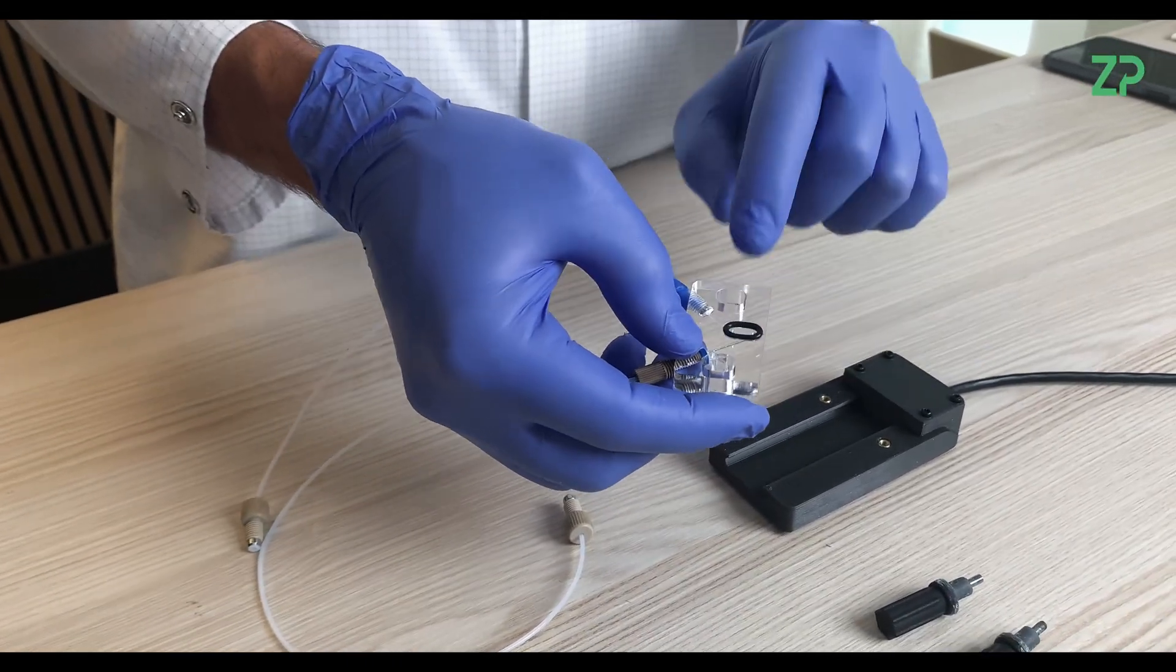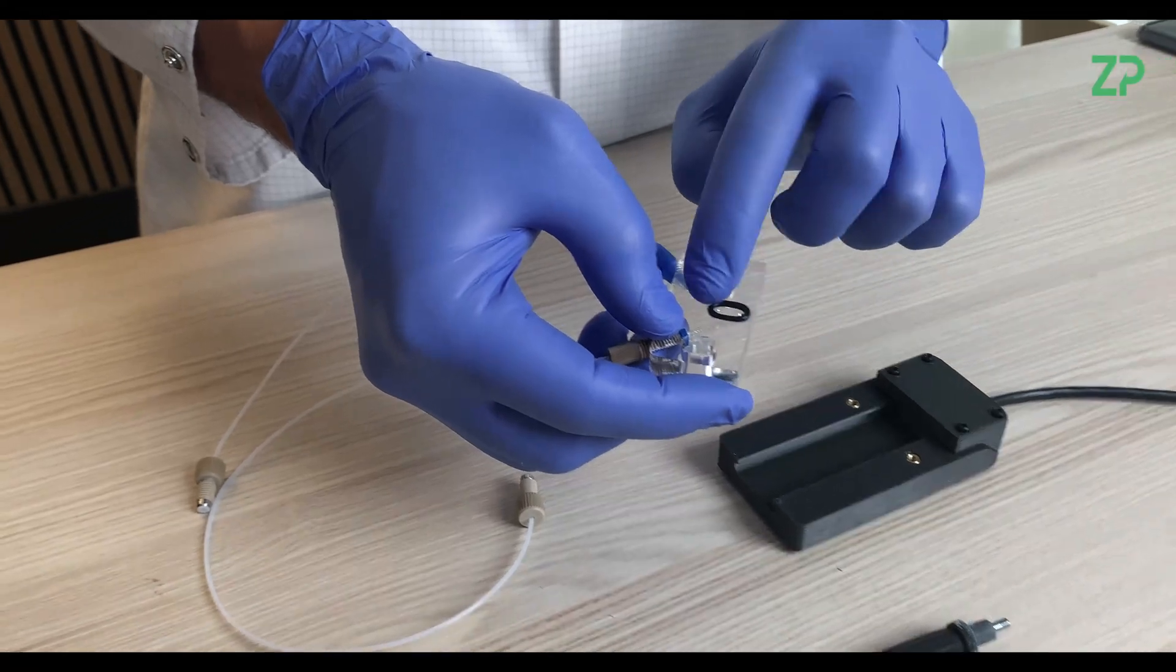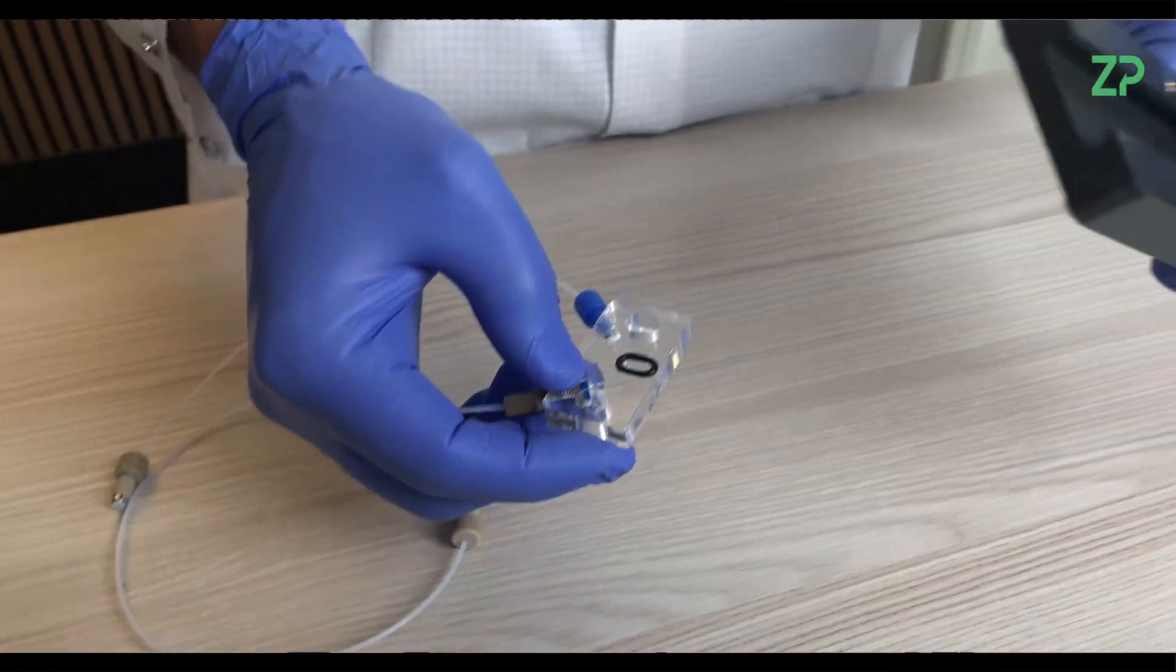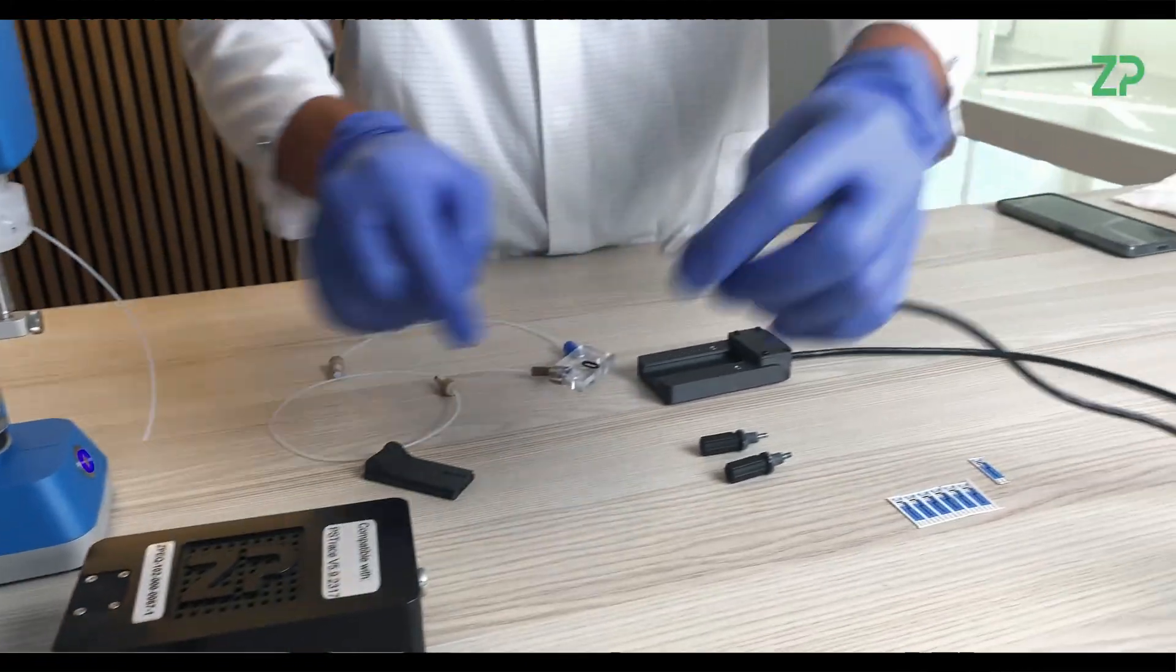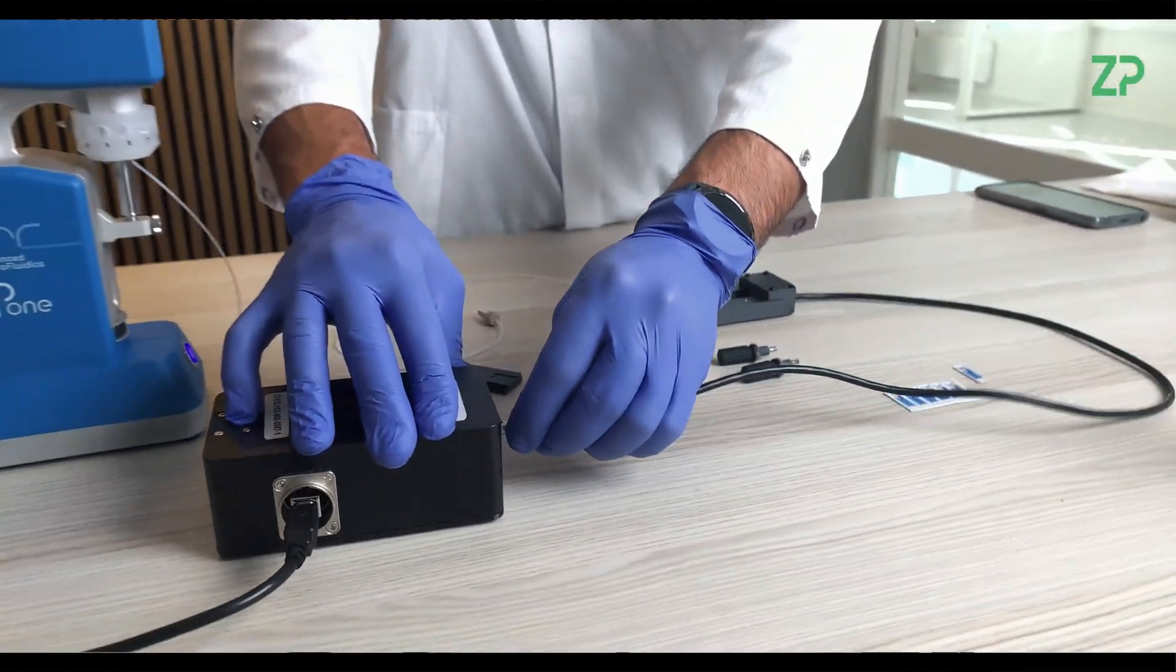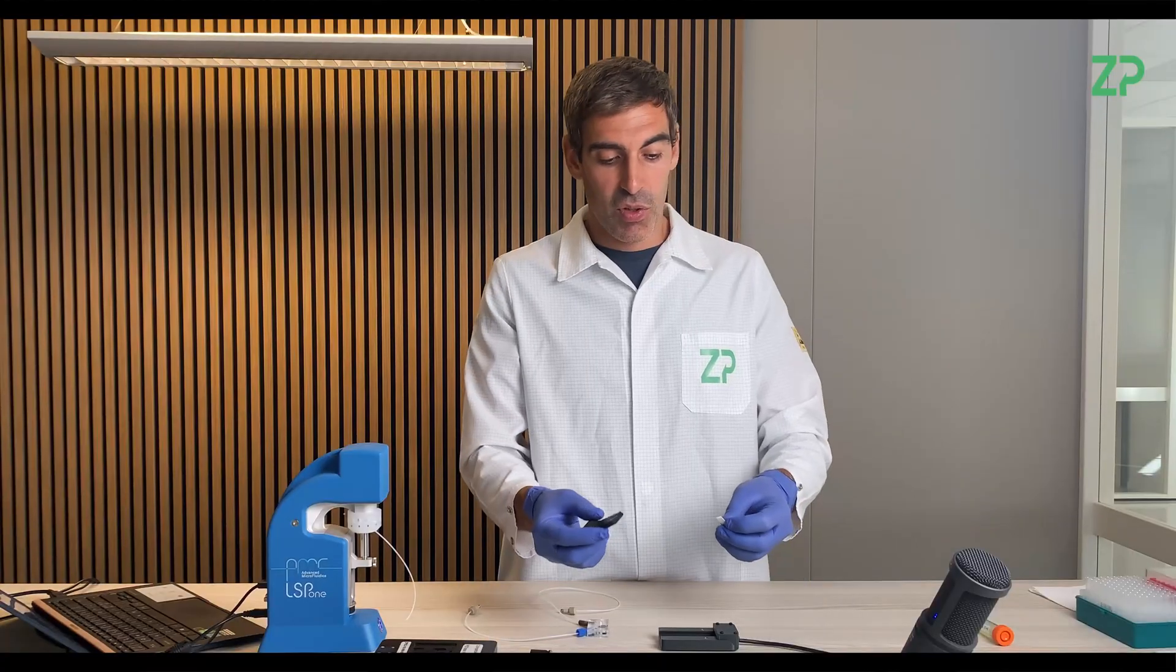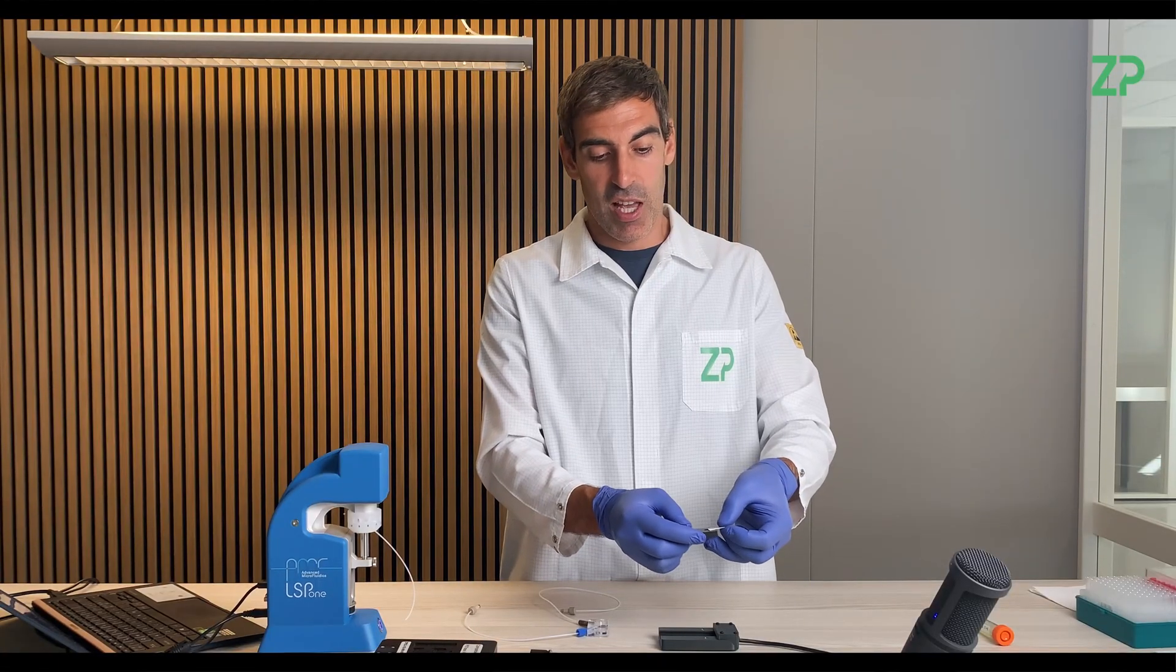The volume chamber where you have the volume that's involved in your ring, and you have the main parts which has the contact to the contact pads on the sensor and the cable to the Anapod.